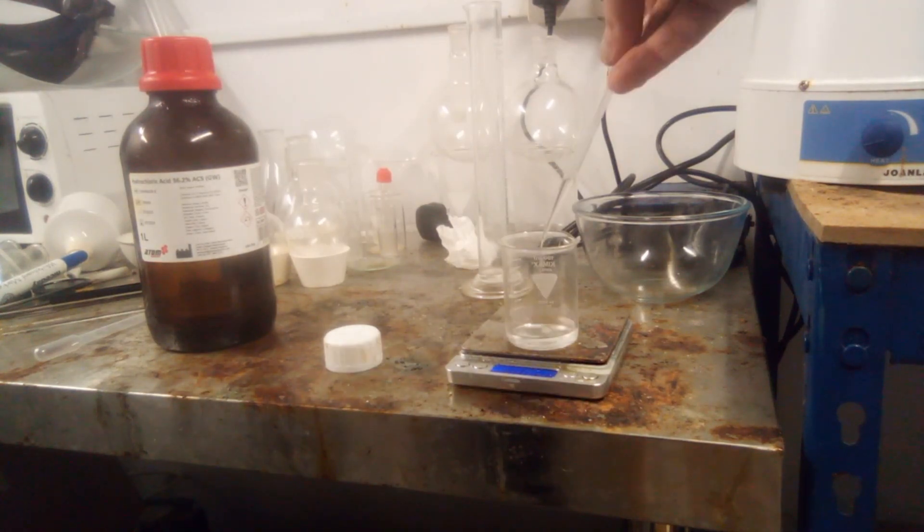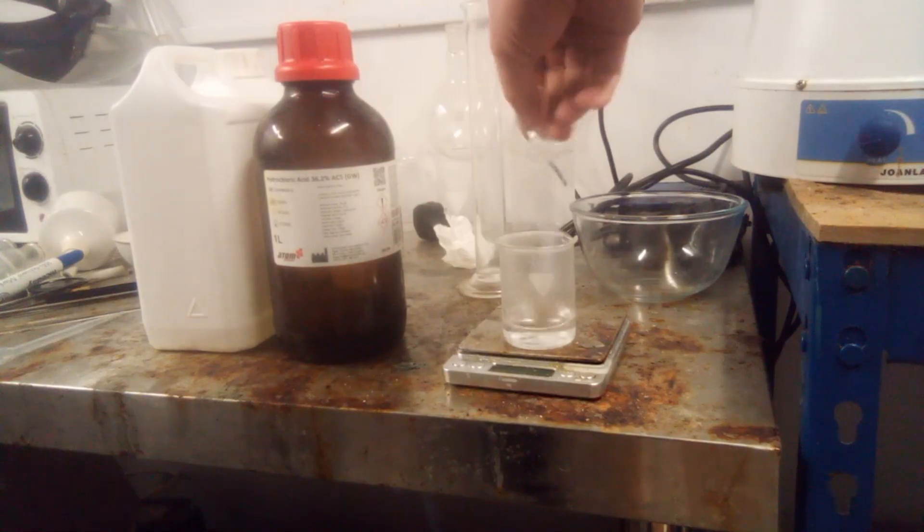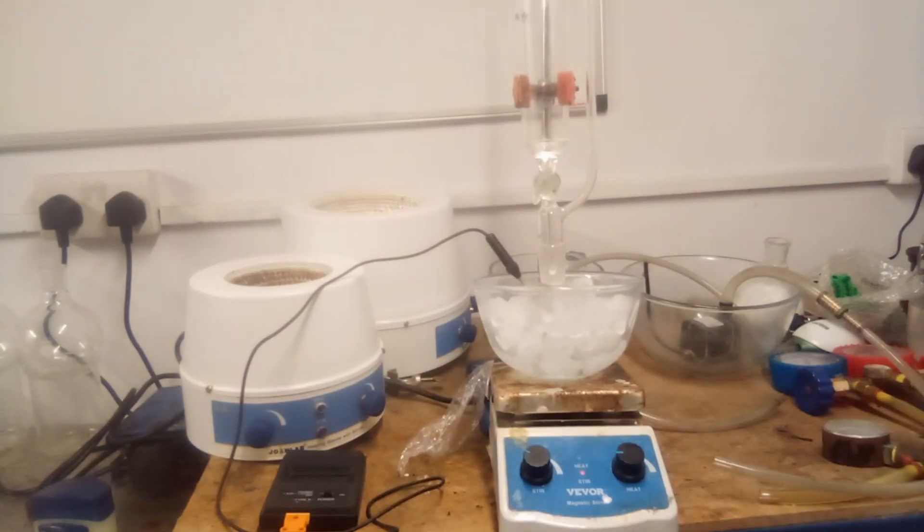37% hydrochloric acid was diluted to half its original strength using water, cooled to fridge temperature, placed in an ice bath, then pyridine was added to it slowly and carefully using a dropping funnel. The reaction between the two is very exothermic, and if carried out at ambient temperature, some smoke can be seen, which is the hydrochloric acid boiling off. The resulting solution of pyridine hydrochloride was then warmed to ambient temperature.